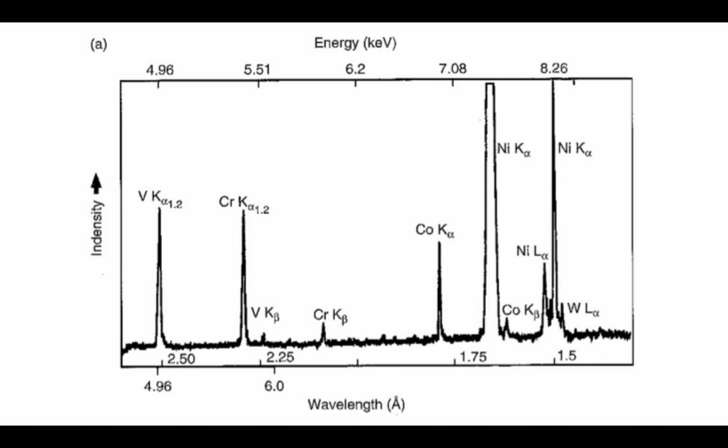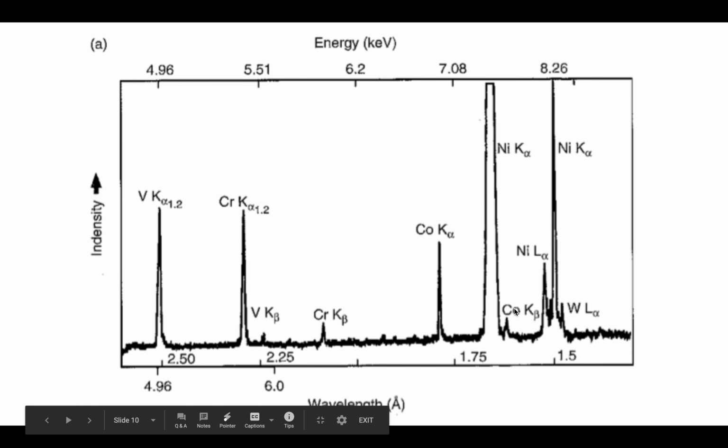There can be some issues when integers are similar to other values. For example, cobalt K alpha is an integer value of the wavelength for sulfur K alpha. Basically, sulfur K alpha is equal to 3 cobalt K alpha. And so there can be issues there with the order of reflection and being able to detect other elements. So there is some overlap concern when you have these different orders of diffraction. But that's something that we can expect in these various cases.